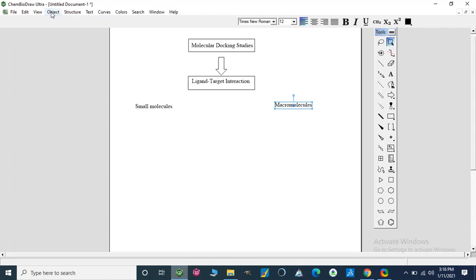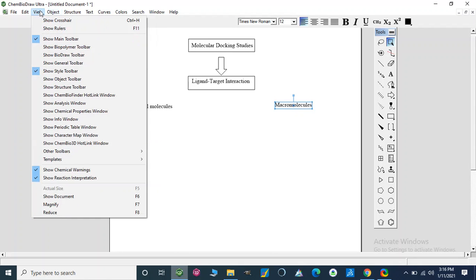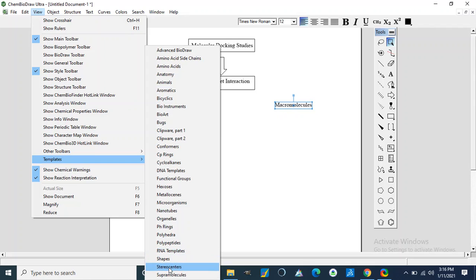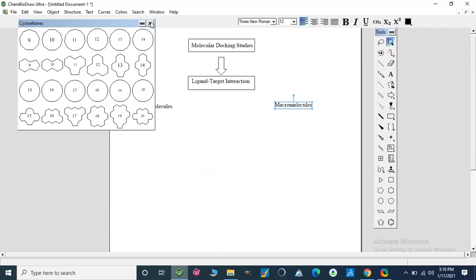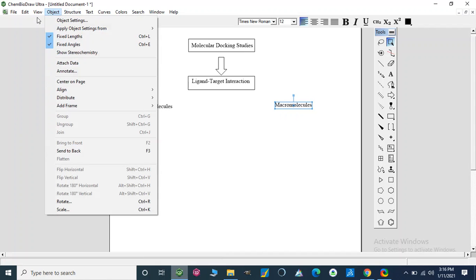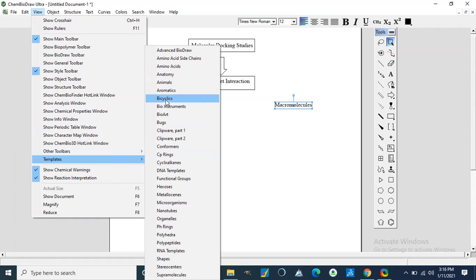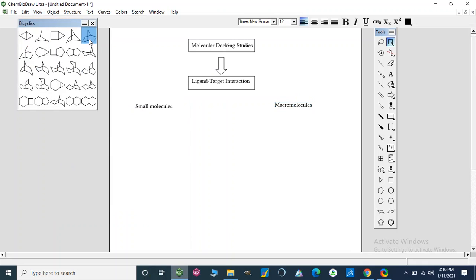We can draw a small molecule from here. I am going to use this template. So we have an aromatic ring, an aliphatic ring, and a cycle. We also have napthalene, a stereocenter, and cyclohexene. We can add some types of structure directly from this template. So this is our small molecule.